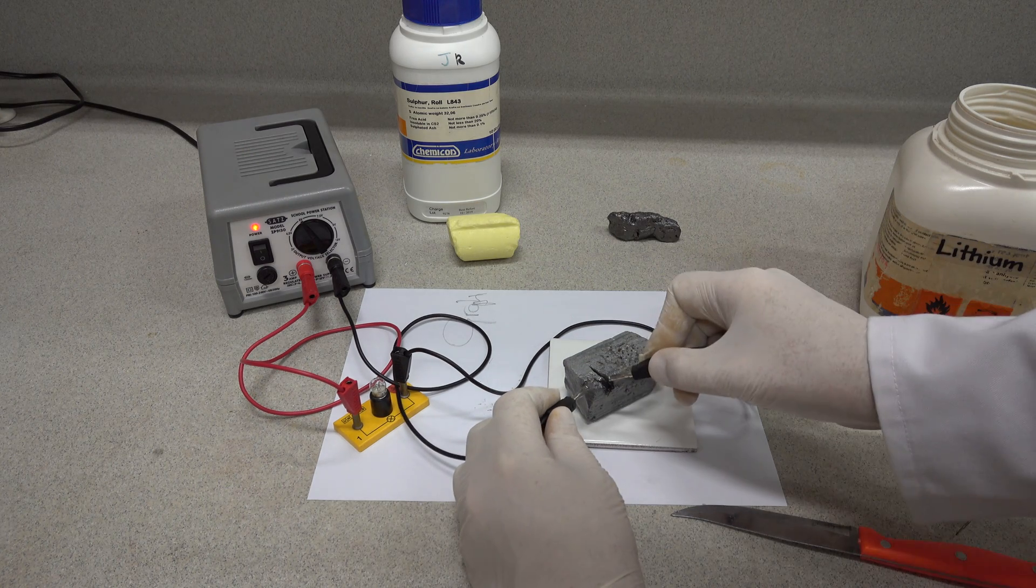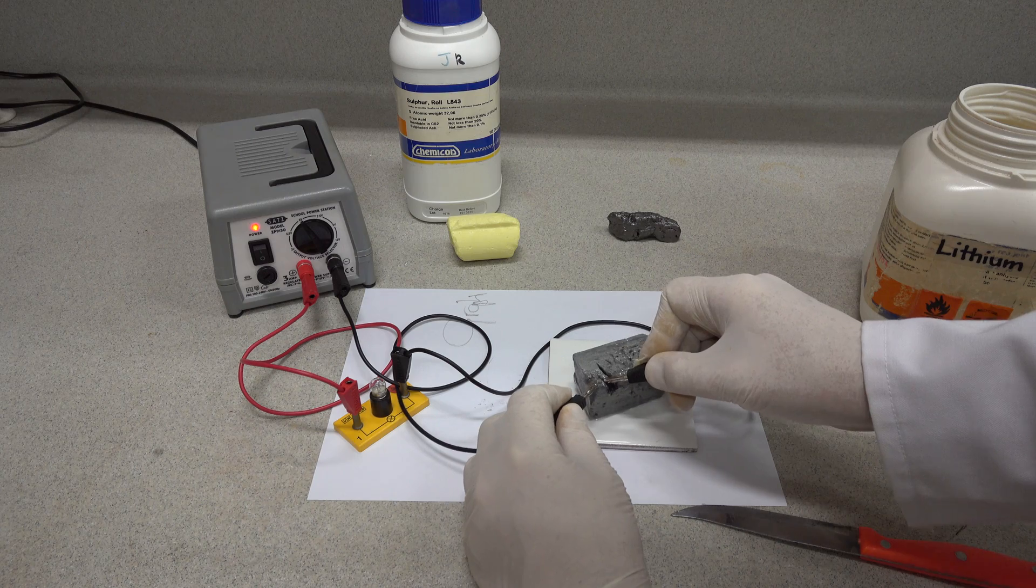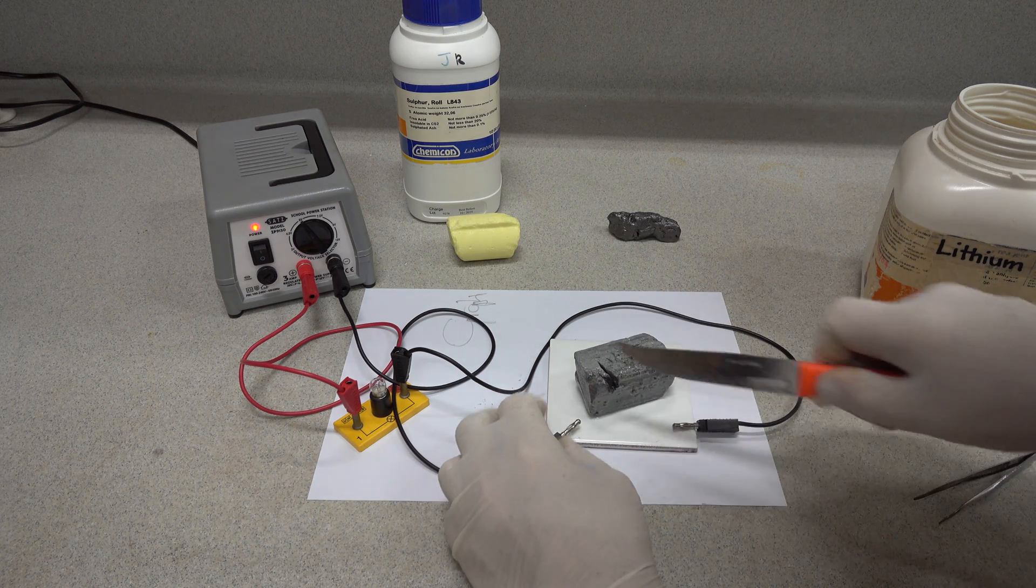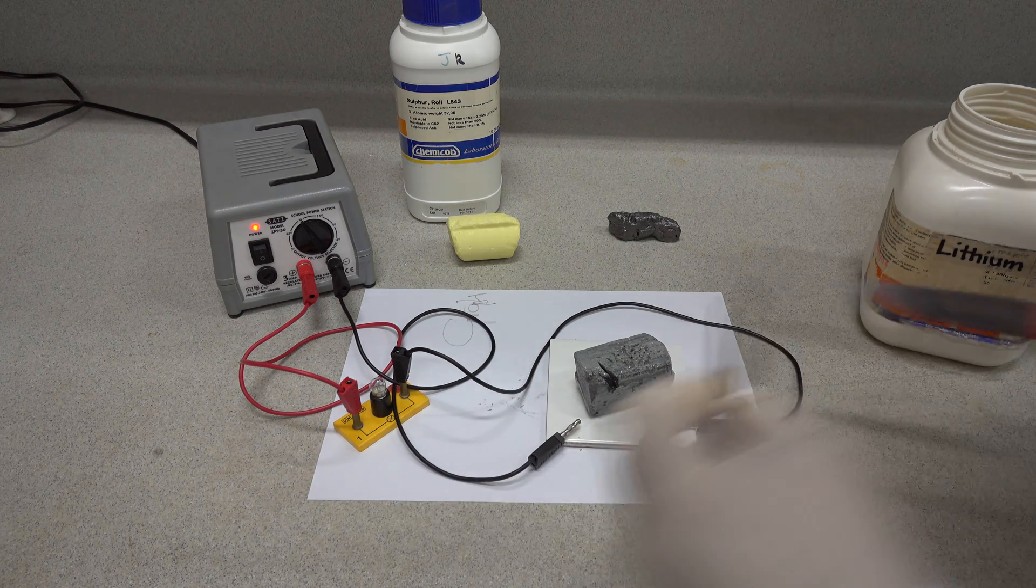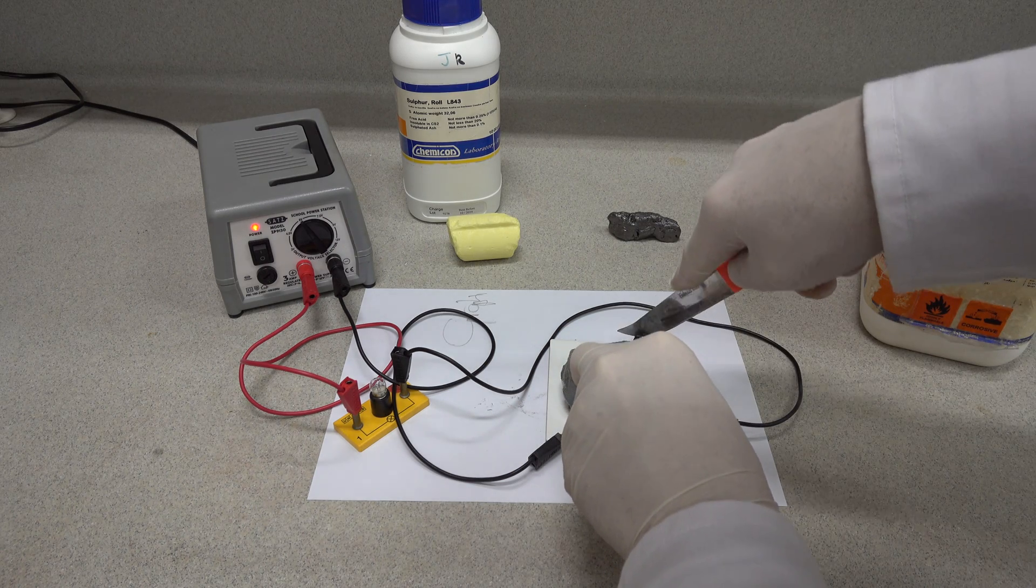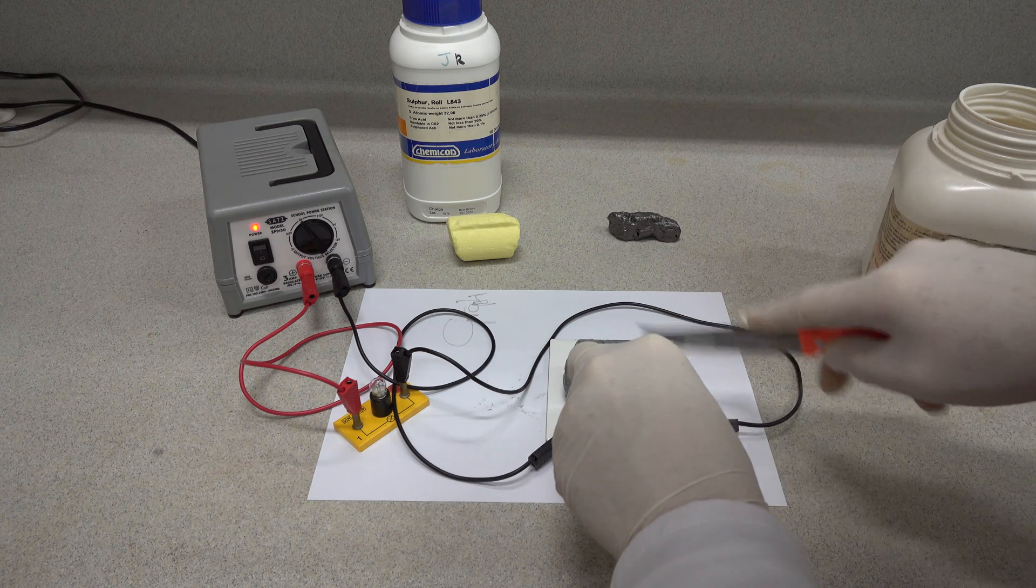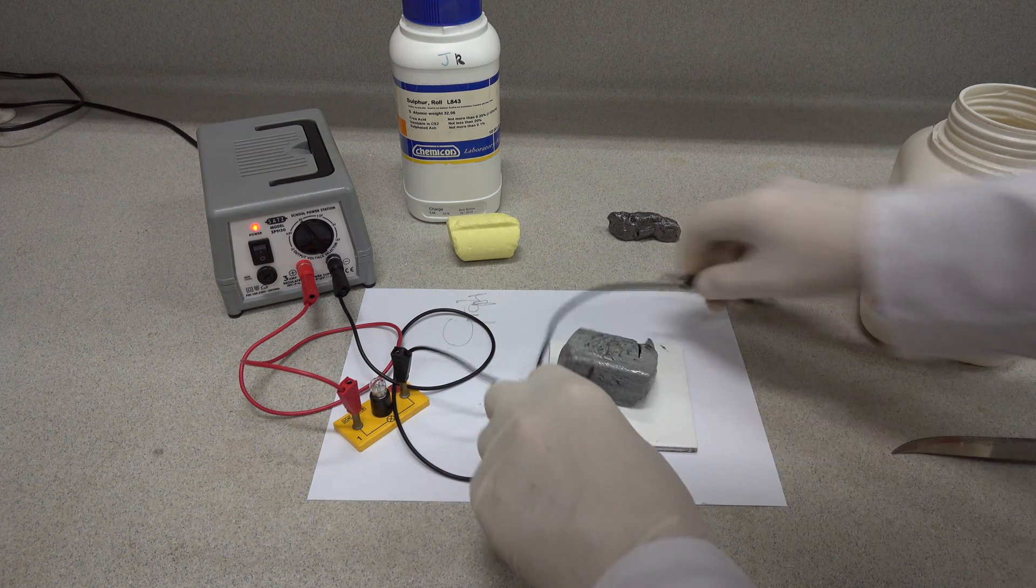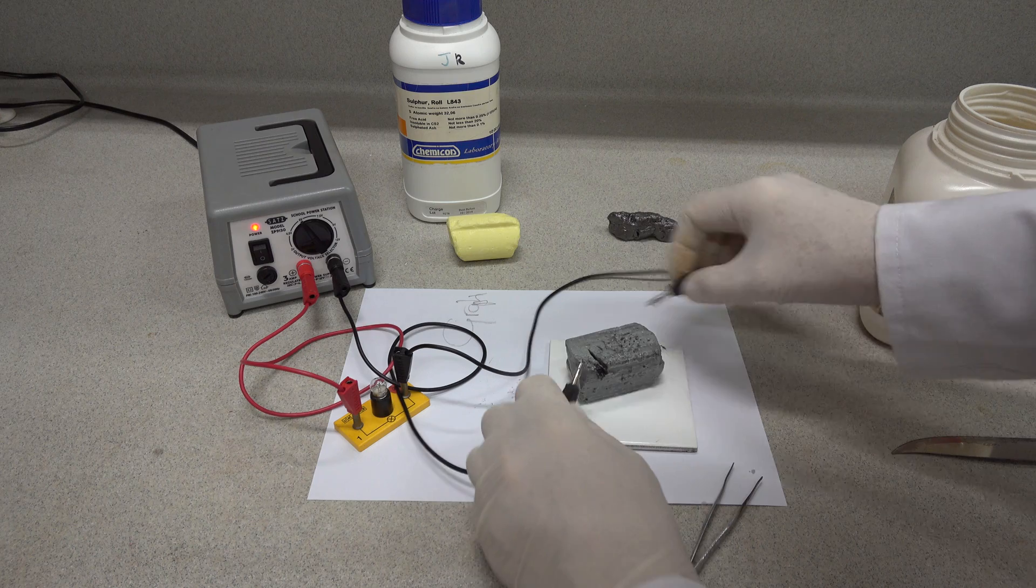So again, if we test our lithium with the electrical contacts... probably got some oil in the way there. Let's just manipulate that a little bit more. Fresh cut. Fresh surface of the lithium on either side. Have to be careful, it's a very reactive metal. Let's try again.